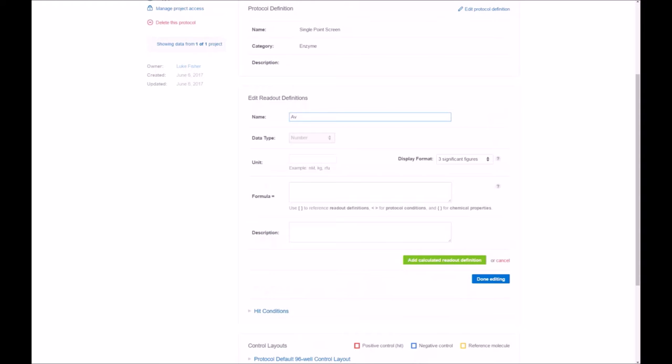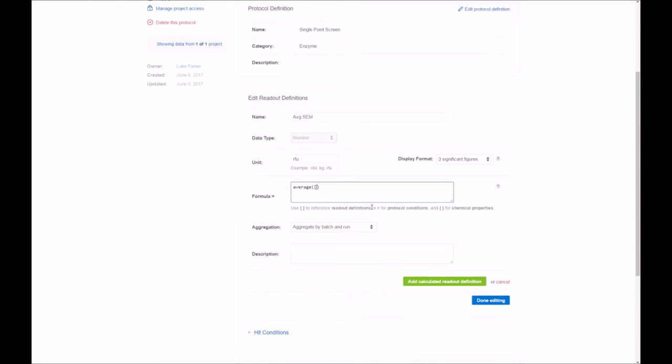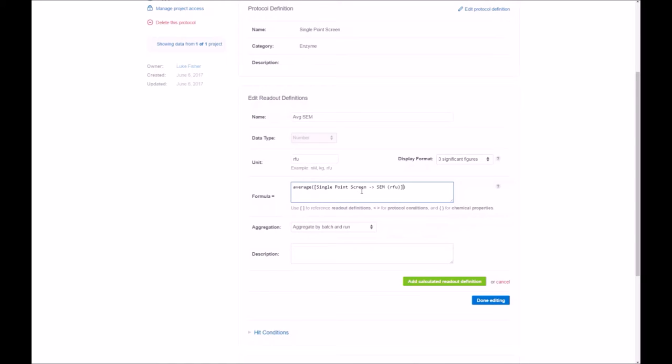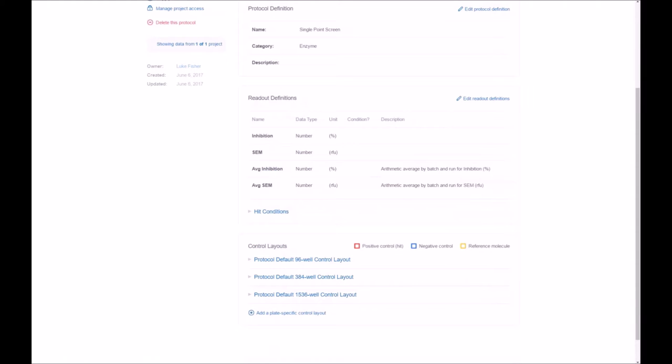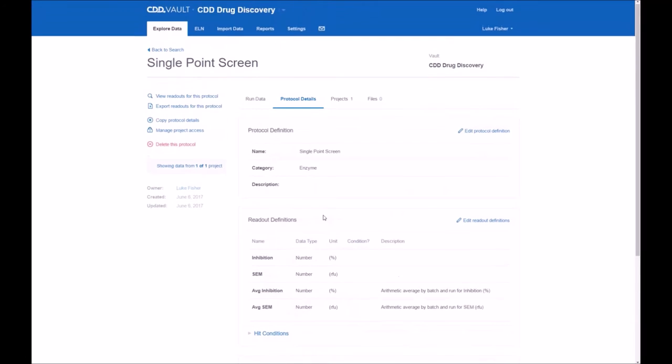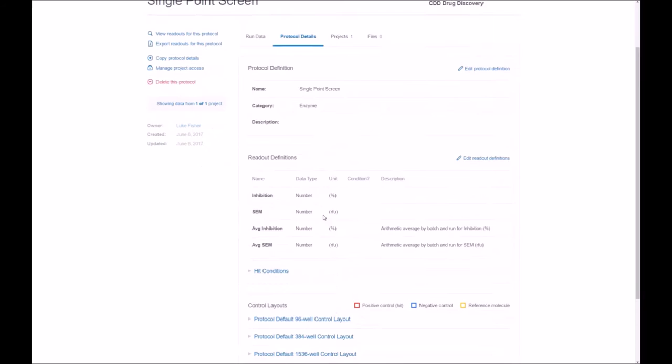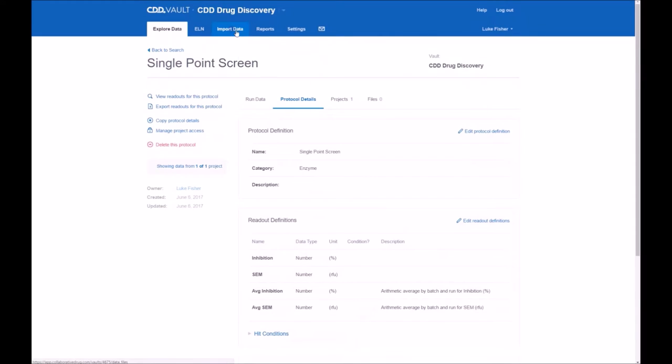Repeat the operation for SEM. Select the correct option and add. Once we get done editing, we're set to go. There is some other available options for hit conditions and control layout, which we won't use in this video, but we'll discuss at a later time in other videos. So now we're all set. Let's go to the import data option.